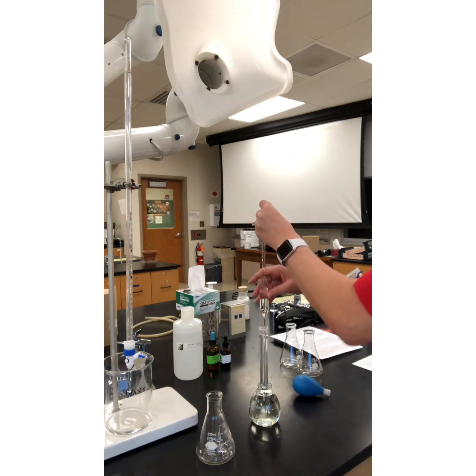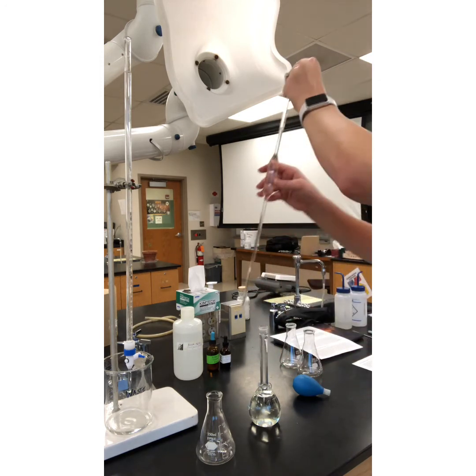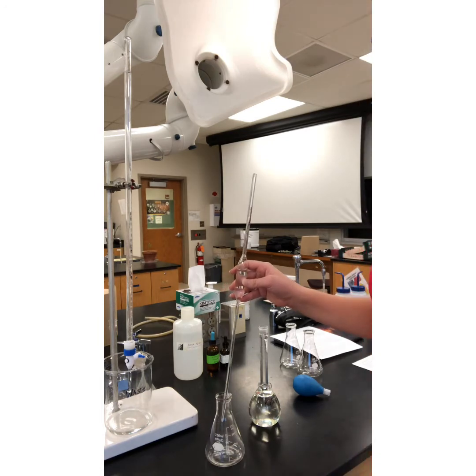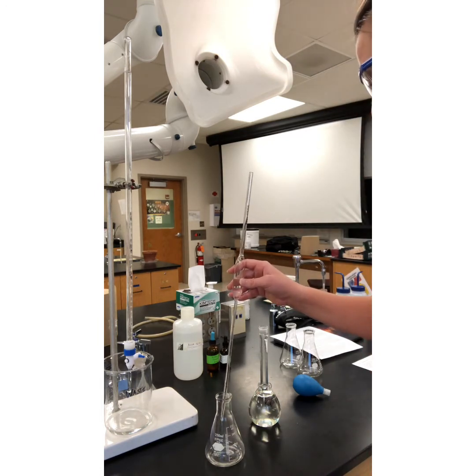You guys can see that or not. And I'm going to go ahead and slowly let my solution out until my meniscus reaches that line. And I have exactly 25.00 milliliters of my solution. Go ahead and put it into my Erlenmeyer. So I've got sample 1 almost ready to go.